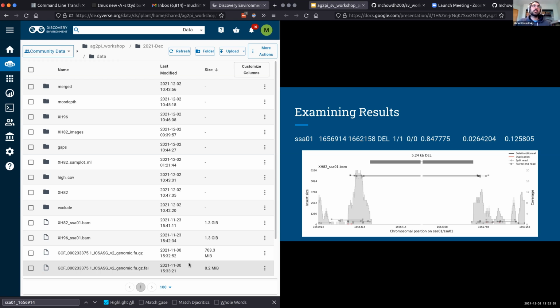Besides the bedtools installation, that's literally the only command that we used sudo with. And in theory, you can actually create a conda environment with bedtools in it as well. So in theory, you don't really need to use any administrative privileges to be able to run this in a Linux environment. You could run any of this in, say, an HPC environment where you don't have root privileges, and you can just use conda to install these types of tools and run them like that.